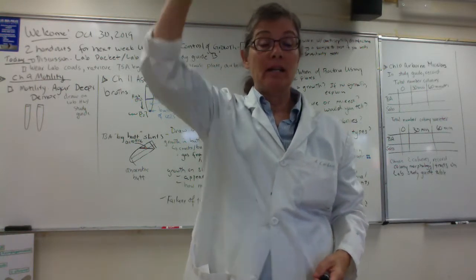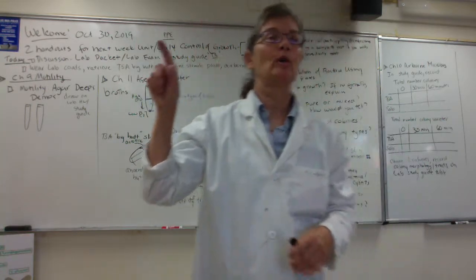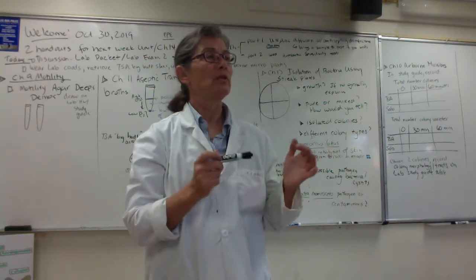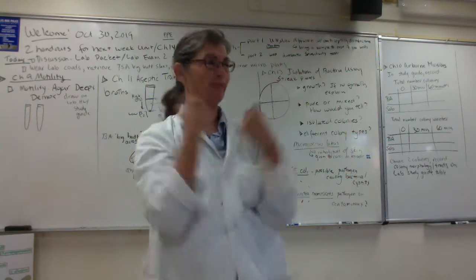Okay? And again, folks, sometimes there's a second microbe hiding in quadrant 1 or quadrant 2. So what do you think, you guys? Do you think those urine samples were pure cultures or mixed? Awesome. Good job, you guys.